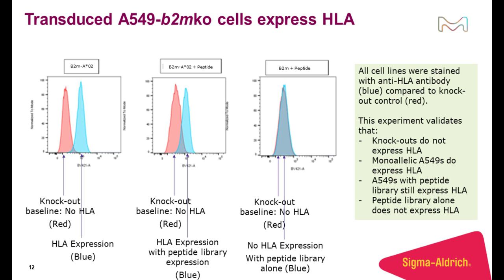In the second figure, we introduced the expression of the peptide antigens and showed the same shift, demonstrating that the HLA is still present and it's active with the addition of the peptide antigen expression. In the final figure, we have expressed the peptide antigen in the absence of HLA. And so the library is present, but the HLA is not. And as expected, we don't see surface presentation of the HLA when we stain with that anti-HLA antibody.